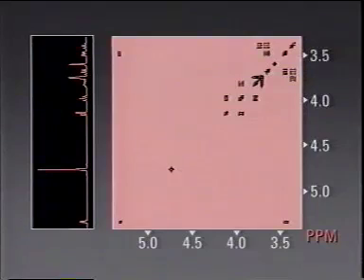Close examination of this plot would tell us all the coupling relationships in the whole spectrum. When spectra are complex, this information is invaluable for spectral interpretation. There's another program of pulses that can determine the spatial proximity of nuclei, whether or not they're coupled. Such methods are now routinely accessible and make NMR spectroscopy a tool of considerable power and flexibility.